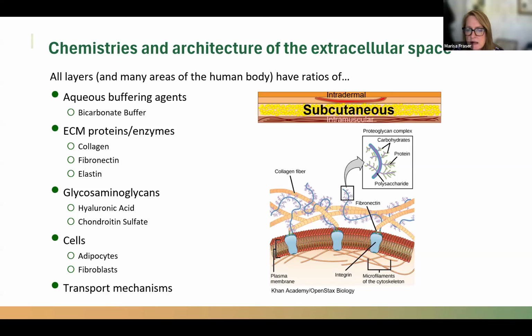Great, thank you. A few more. Are there any limitations on the molecules that can be integrated into the Scissors artificial ECM? Yeah, the standard ECM presented here is aqueous based, so it would be great if we weren't trying to include some sort of highly lipophilic molecule. The only real limitations are going to be on the activity side.